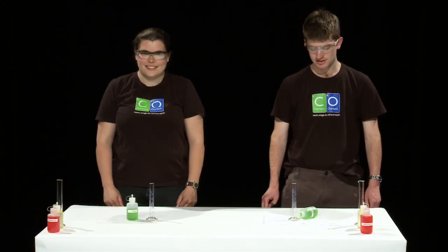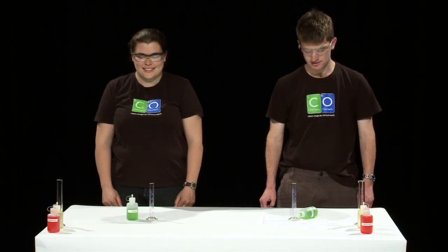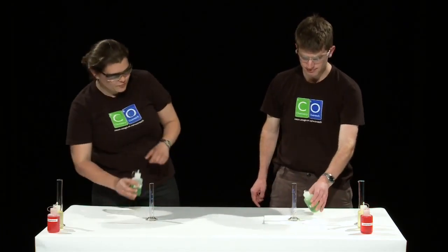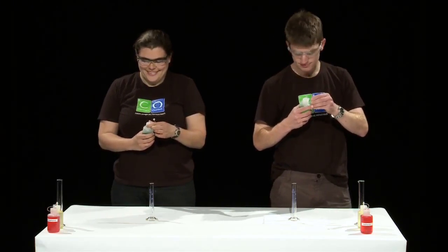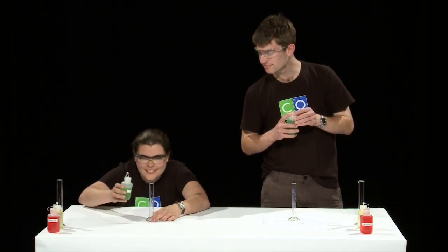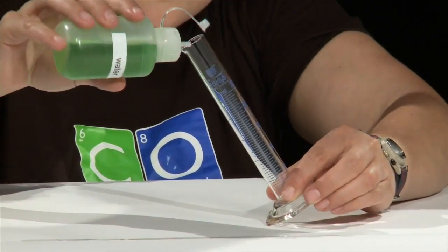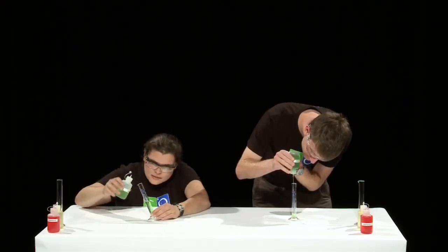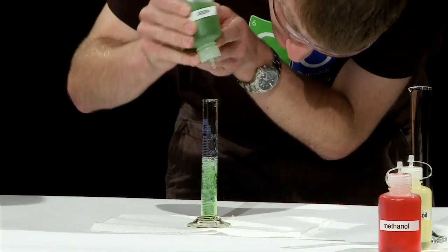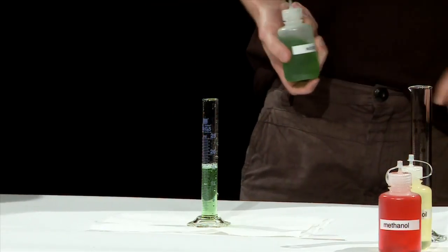To begin the experiment, accurately measure out 20 milliliters of water using a 25 milliliter measuring cylinder. Now it's a good idea to squirt the water down the side of the measuring cylinder. Squirting the water down the middle just ends up making bubbles. That makes it hard to measure out the volume accurately.